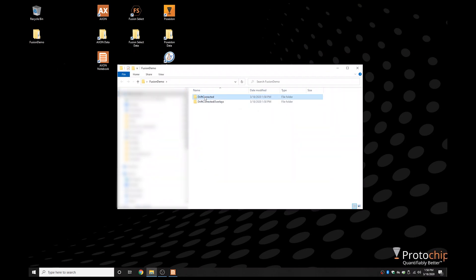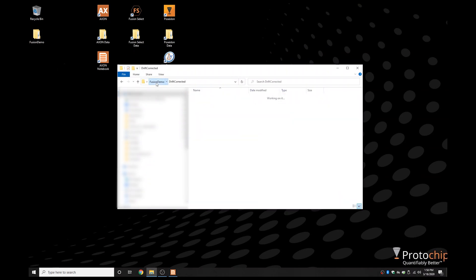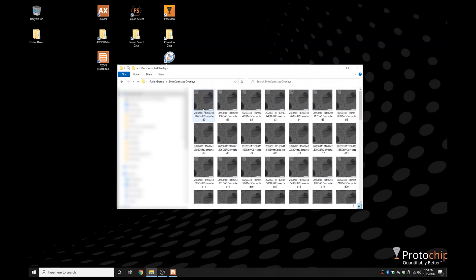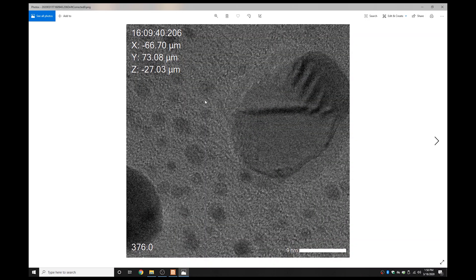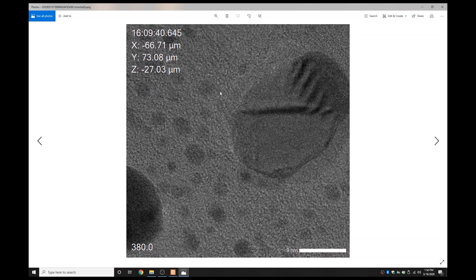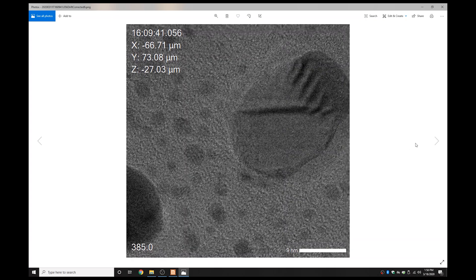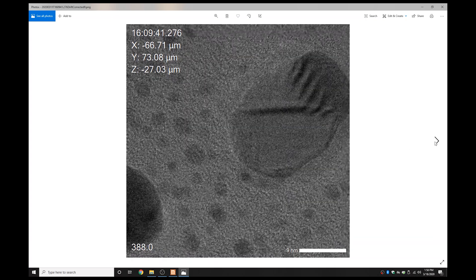All images are stored in the target destination and are immediately available for easy processing, storage, and analysis using any post-processing software platform you choose. This ensures that there are no barriers to our customers being able to publish quickly and efficiently.